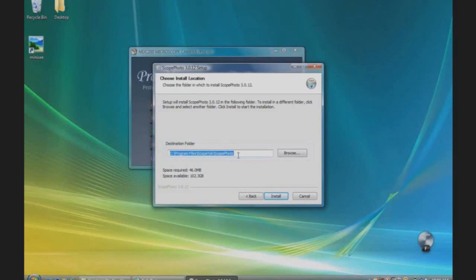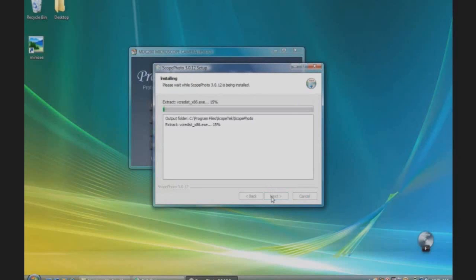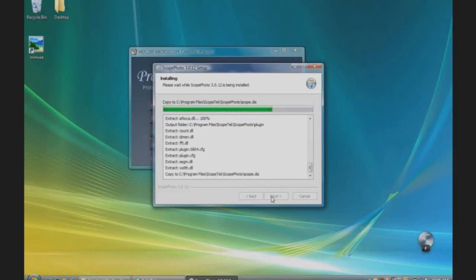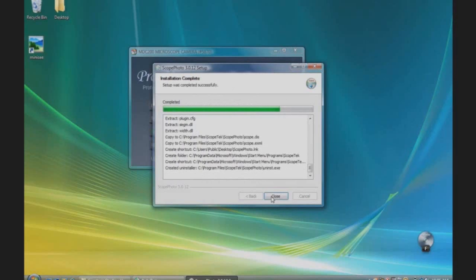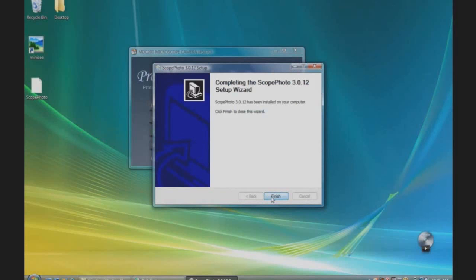Choose the destination folder. We will use the default folder again. When installation is complete, select Finish.